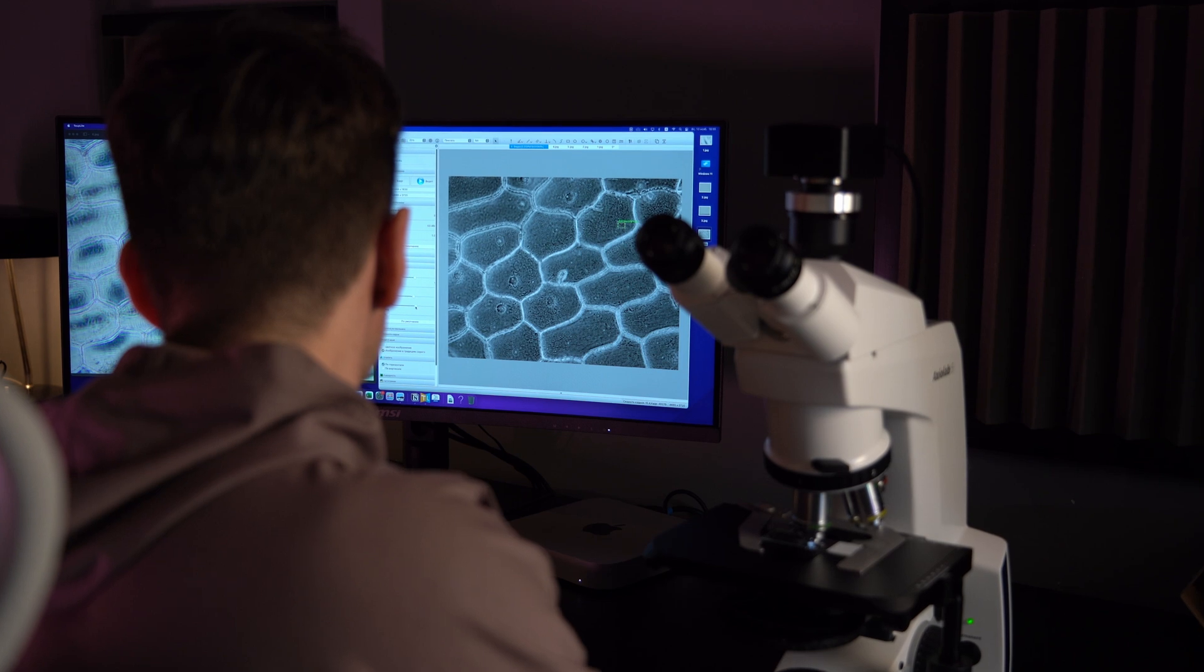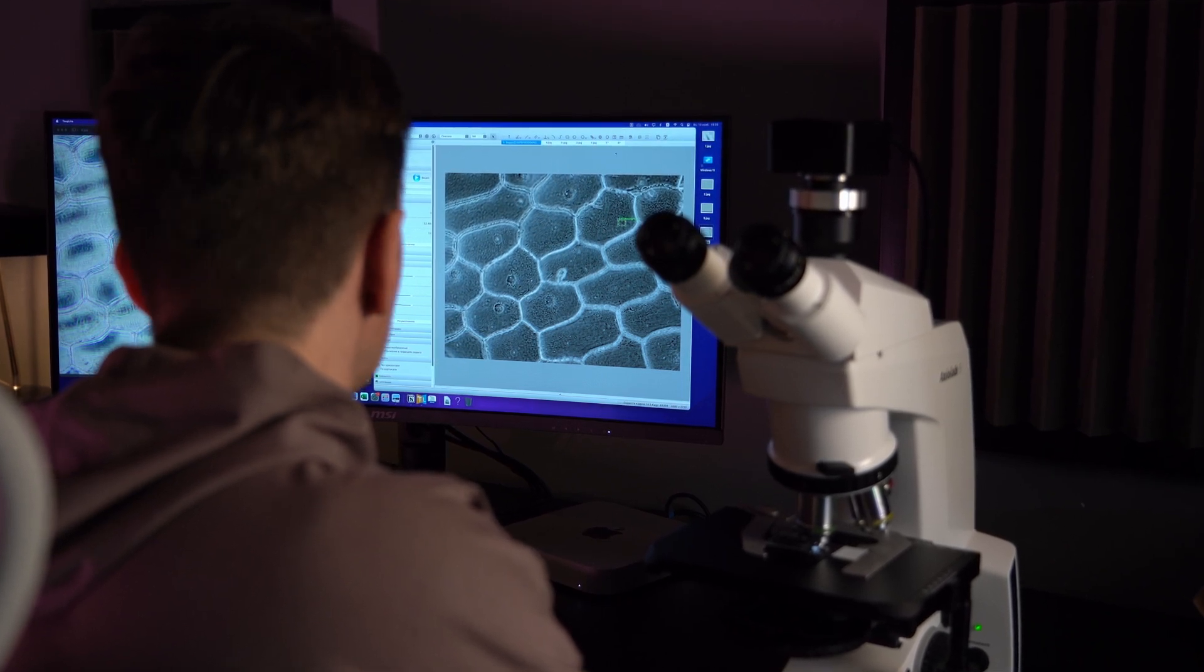Done! Now your phase contrast image is perfect and your microscope is ready for acquisition.